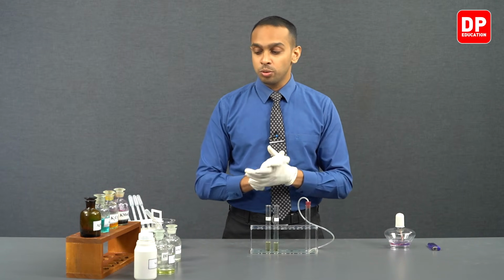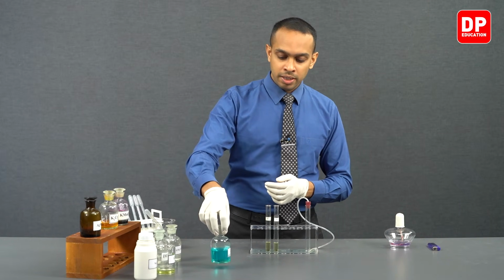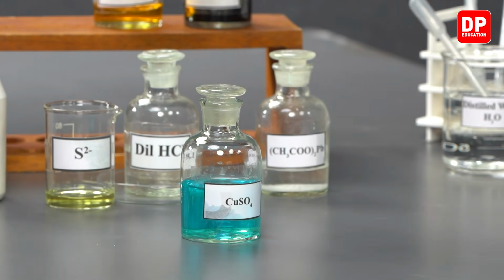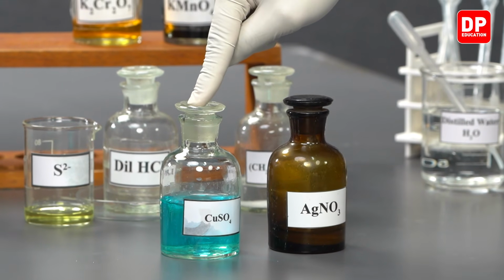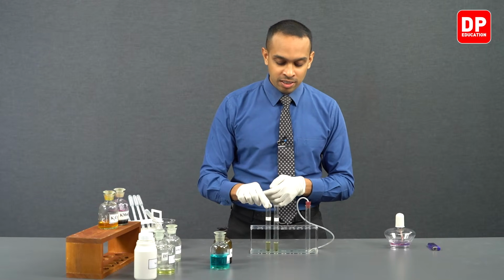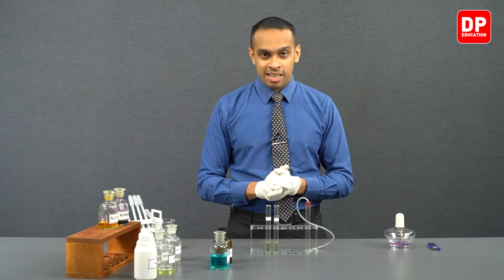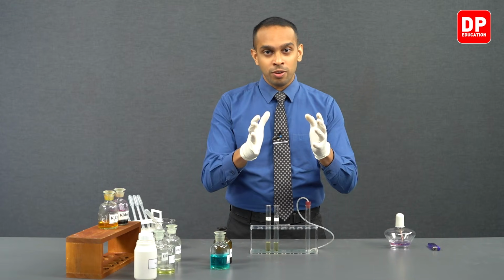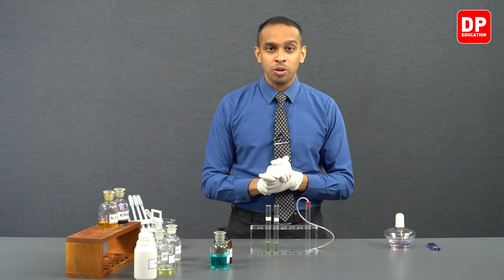So we have taken it into two different test tubes, and to one test tube we will be adding copper sulfate, and to the other we'll be adding silver nitrate. Now copper sulfate contains Cu2+ ions, and our sulfide aqueous solution contains S2- ions. So Cu2+ and S2- together will form cupric sulfide, which is a black color water insoluble precipitate.